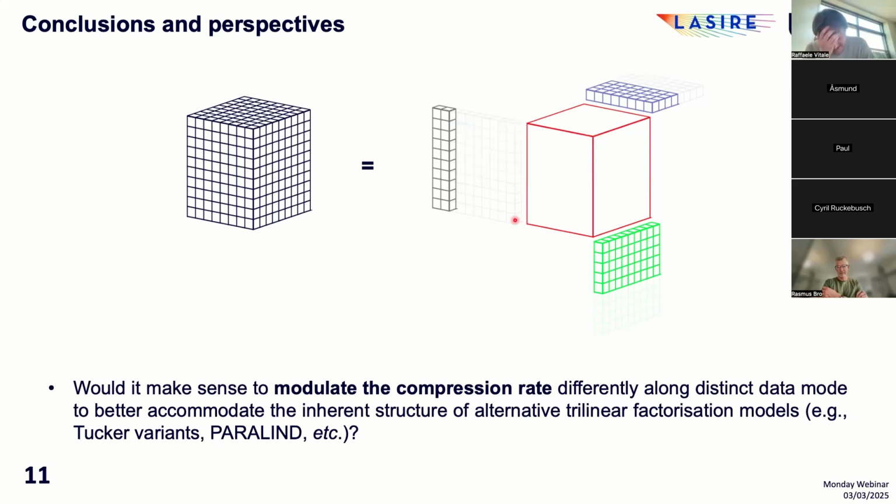Thanks, Rasmus, and thanks, Raphael, for the presentation. I can see that the models that you are playing with are rather simple in my mind with the complex samples that we are looking at. We have just experienced that using a general least squares procedure or a general trilinear decomposition does not give the global minima ever. Have you played? Do you have any?